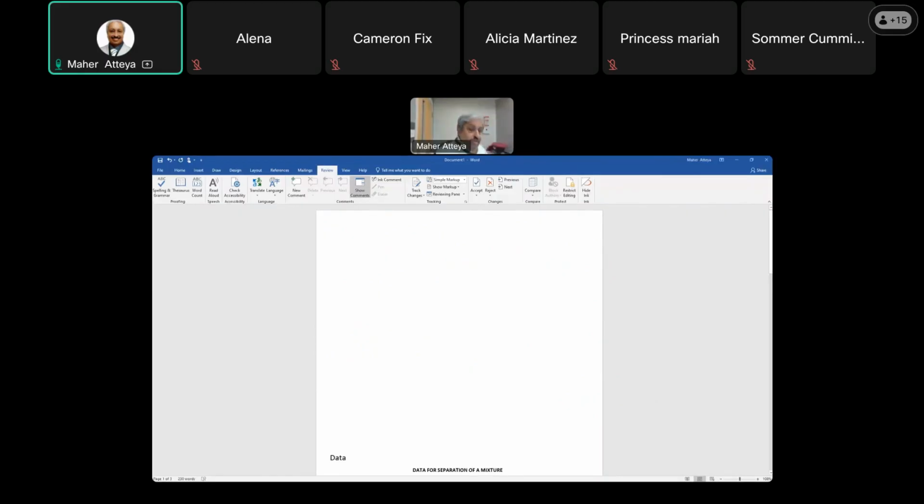So we'll be using their what? Their physical properties. What are the physical properties? The physical properties are as follows here. Ammonium chloride has a sublimation feature that both the other ones, sand, silicon dioxide, and sodium chloride, kitchen salt, don't have.